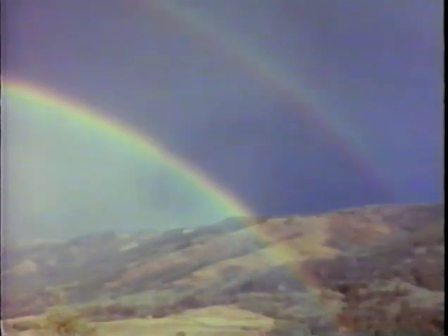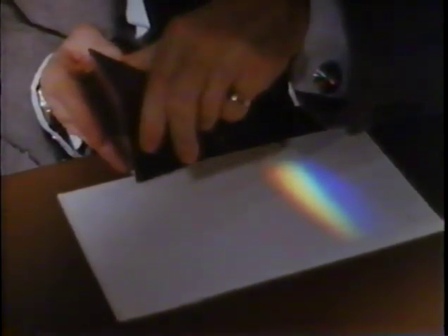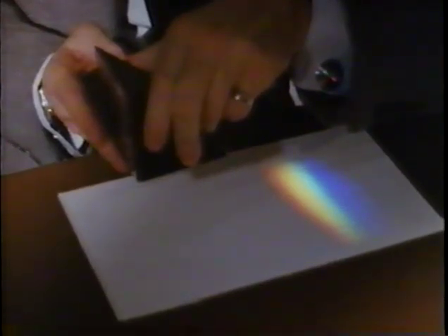One of the most beautiful sights of nature is the rainbow. This lovely spectrum is familiar to us all. But it was only some 3 centuries ago that man first succeeded in producing his own spectrum, and not until the present century that we began to use it in chemistry as a tool in the study of molecules. Isaac Newton first used a prism to break up sunlight, and thus demonstrated that such white light could be separated into different colors which might be regarded as its components.